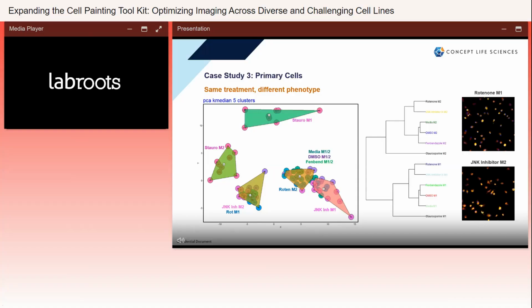A visual inspection of the cells shows them looking very similar, small and rounded with increased autofluorescence. Again, this is showing us that the data is backed up by visual confirmation, and that distinct phenotypes can be identified and clustered together regardless of their source.